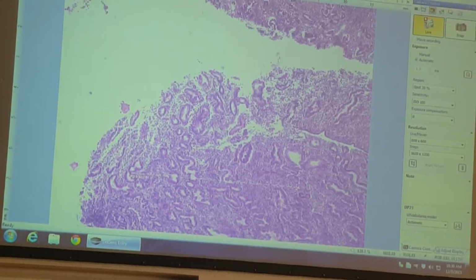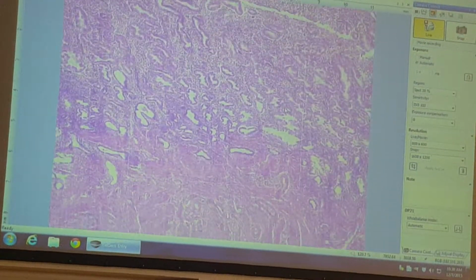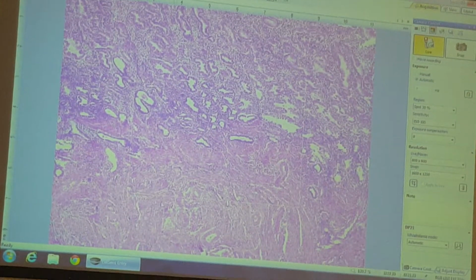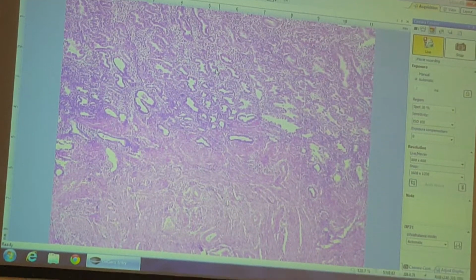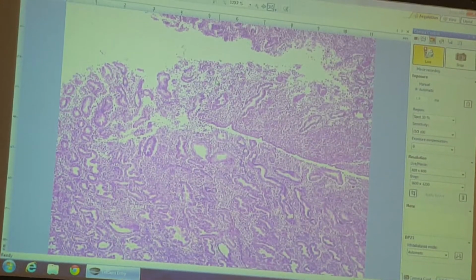So what I'm seeing here would all be endometrium. If I cruise down a little bit, there's where it transitions. This would be the stop of the endometrium and the beginning of the myometrium, because again, the glands terminate. These would be the bottoms of those glands. If I go back up to the surface, that's how I know that it's the menstrual phase.